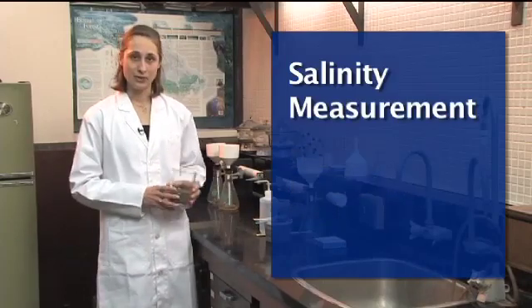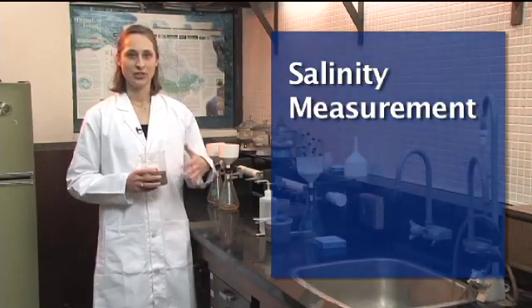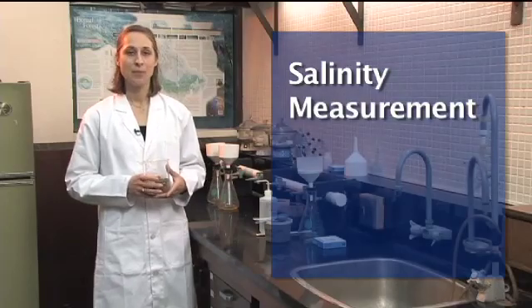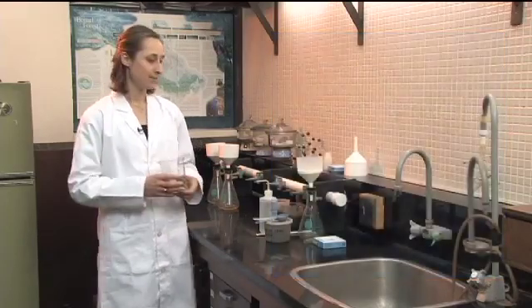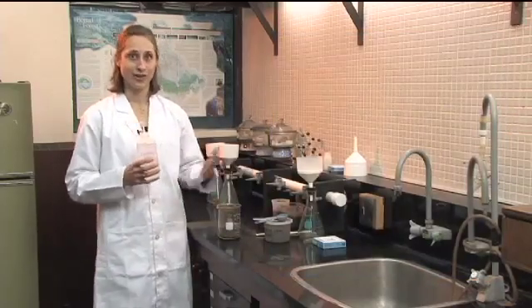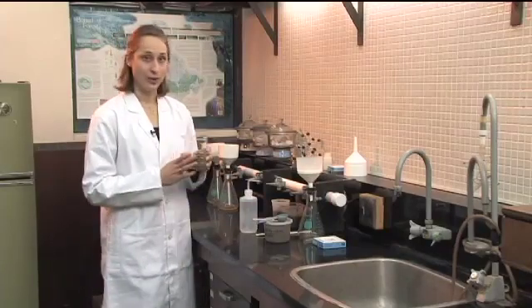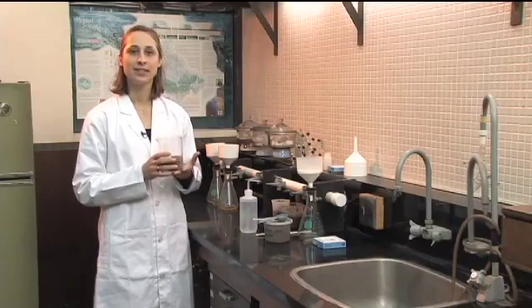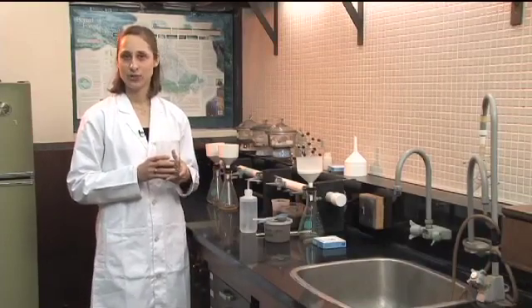What we do is add water to the soil and then measure the conductivity of that extract. You can measure it in the field, but we're going to do it in the lab today by making a saturated soil paste. We use distilled water that doesn't have any salt in it already. I've already weighed out 250 grams of soil that's air dried and sieved to two millimeters.